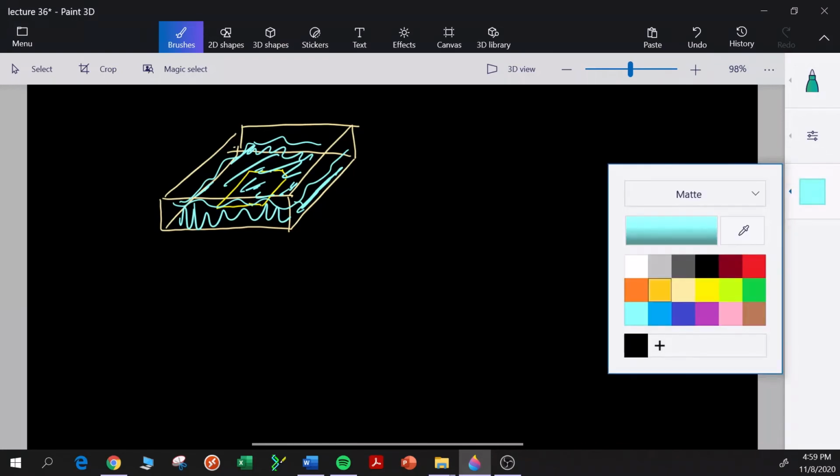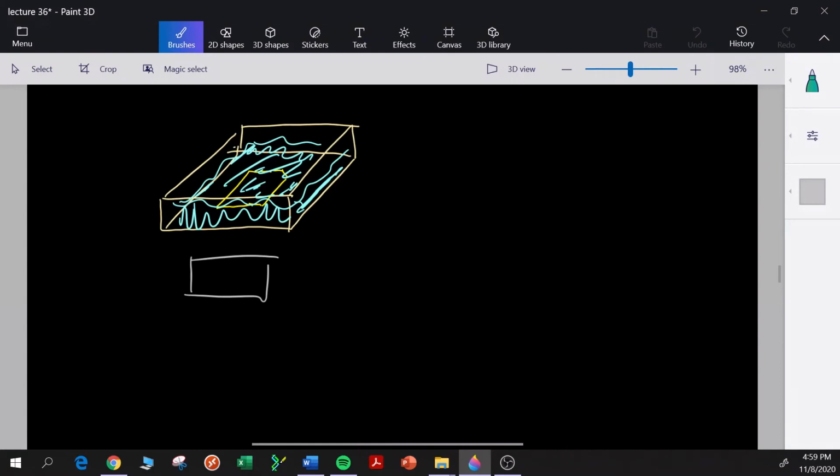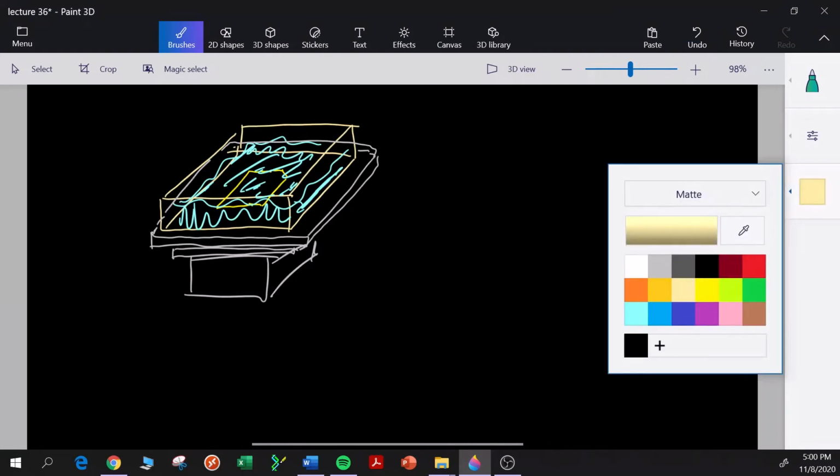This might be on a shaker, and there are many ways to do this. Often this is done in a hybridization bottle, or a heat-sealed Ziploc-like bag, because this probe is radioactive and dangerous, so you have to be very careful, using all sorts of shielding to minimize the researcher's exposure to 32P and those beta particles when 32P breaks down. I have this on a shaker right here. This is one way we could do it. So we'll be adding the probe.